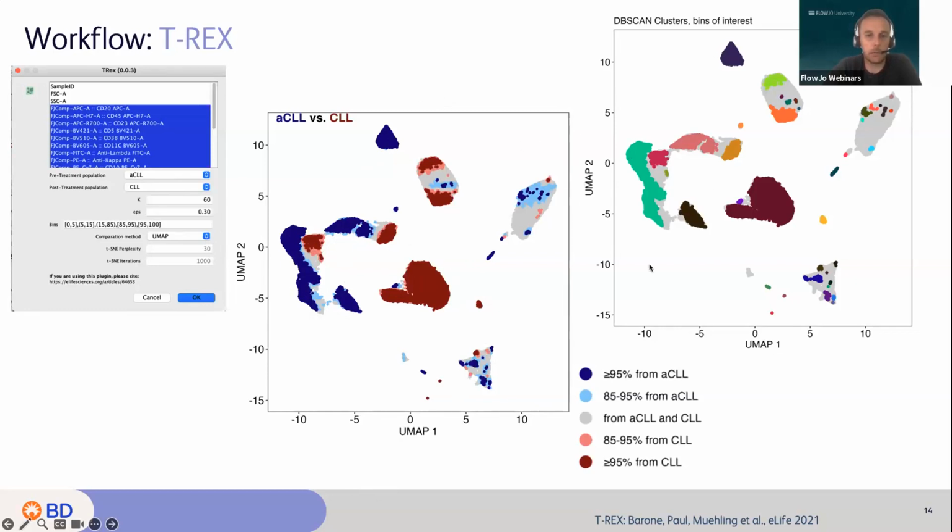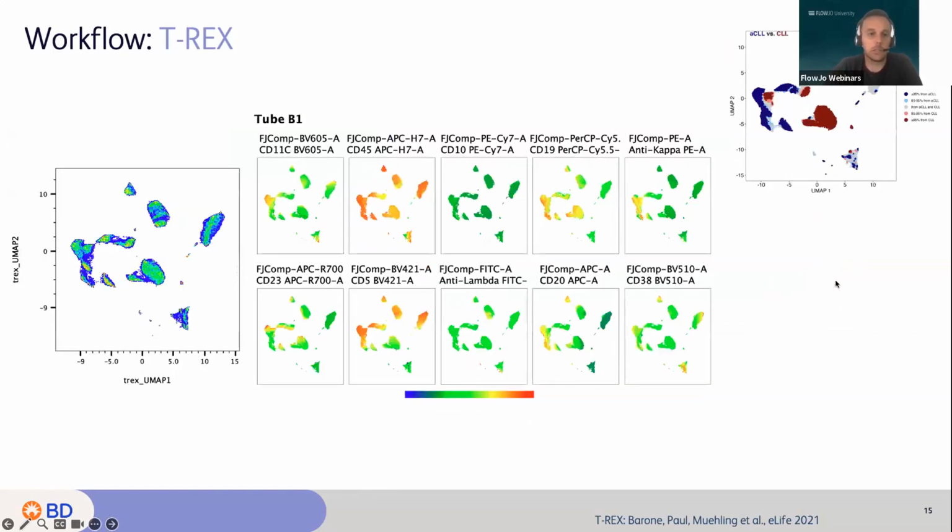And after, it's going to create the different clusters, and you can characterize those different clusters, of course, with Cluster Explorer, or if you want, just by doing a color-coded multigraph and seeing what markers each of those clusters expresses.